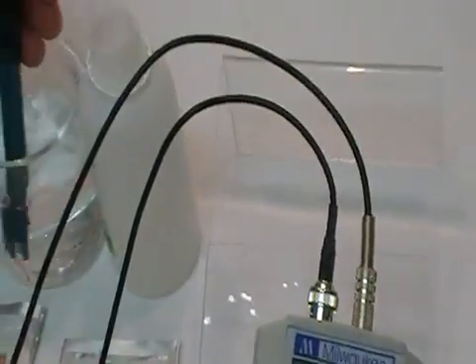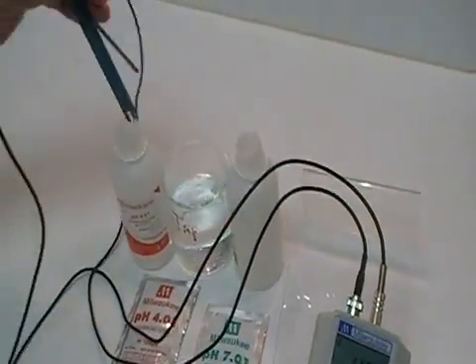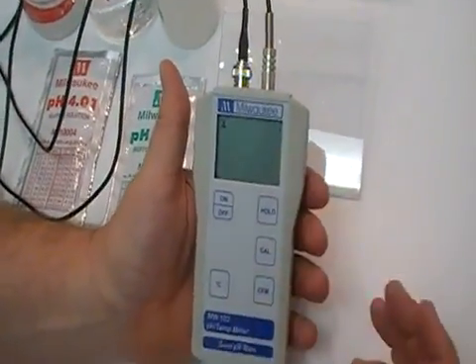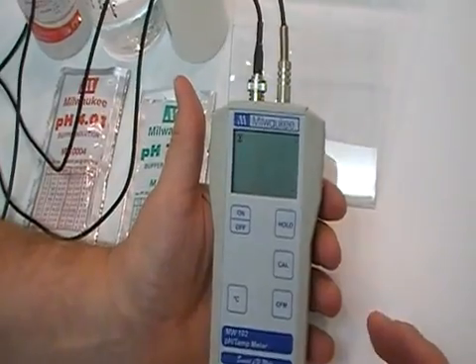You can do a rinse, and then move over into the 4 calibration solution. Now you see the pH is blinking again with the 4 blinking.